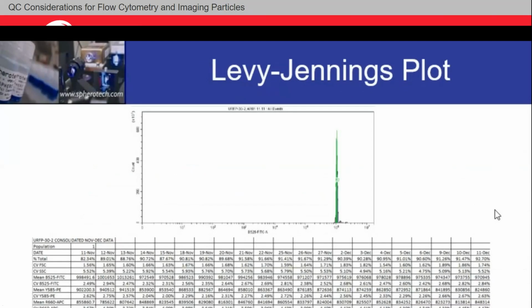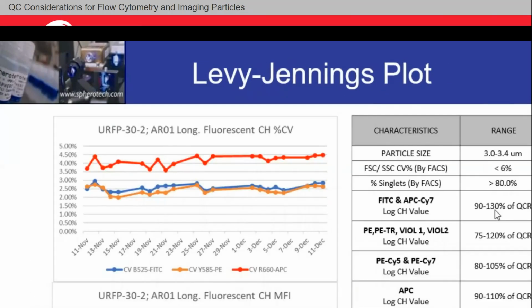In the good old days, in the bad old days, you had to make your own standards. You were usually culturing your own cell lines, which you would then tag on the surface with FITC, and you would be maintaining those cell lines repeatedly, hopefully so that those cells are going to have the same amount of a specific cell marker on the surface that you can quantitate. You can say with a certain amount of confidence they should at maturity have a specific range in the MFI, and you would be making your own linearity particles essentially from biological matter.